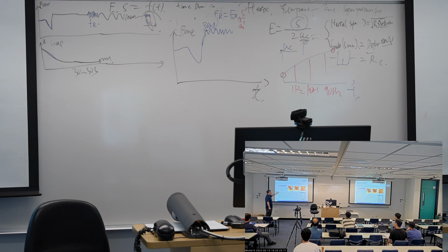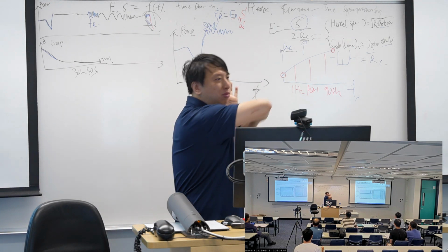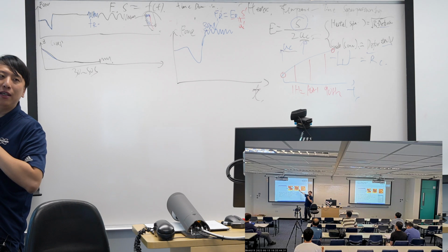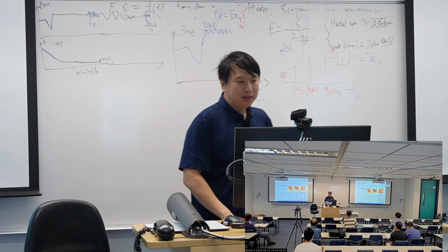So if we're doing the spectroscopy, we do it at one point and generate properties at different frequencies. Or we can do a fixed frequency, but on different areas, different points, to get a mapping. So that's the idea.